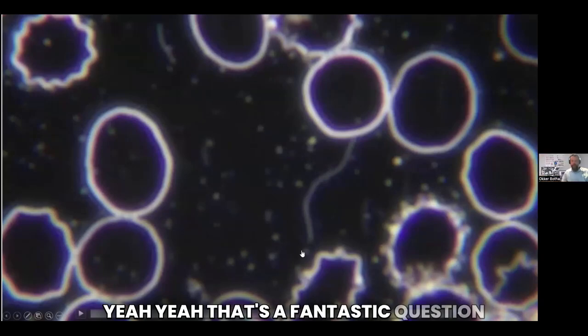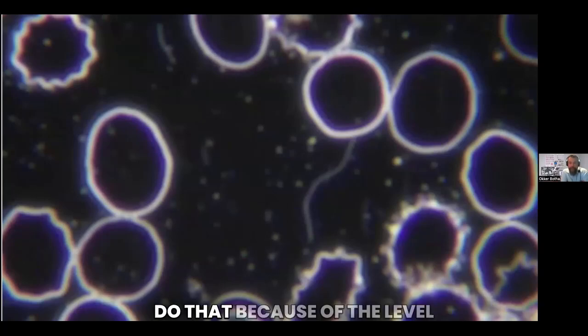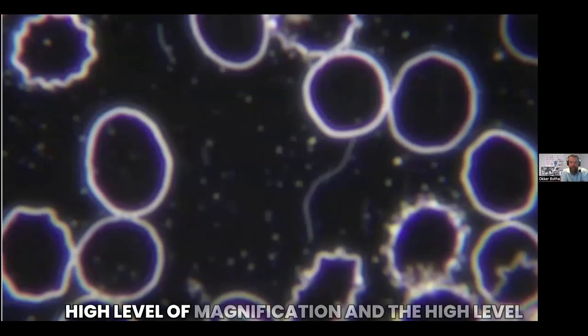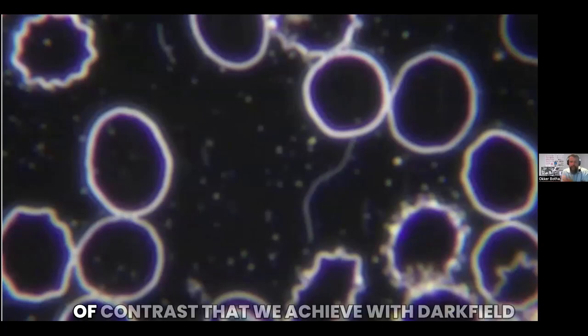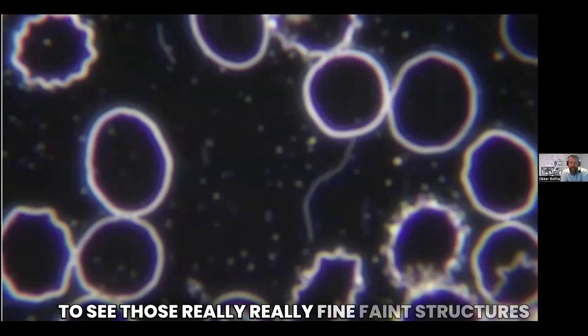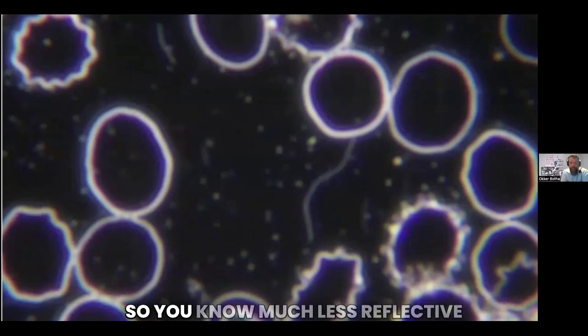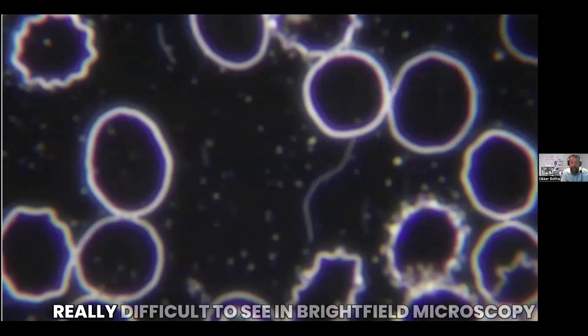Yeah, that's a fantastic question. Thanks, Justin. With dark field specifically, we're able to do that because of the high level of magnification and the high level of contrast that we achieve with dark field. Obviously, with a proper dark field microscope, we're able to see those really fine, faint structures. Cell wall deficient bacteria are, obviously, cell wall deficient, so much less reflective than normal bacteria, and completely invisible or really difficult to see in bright field microscopy.